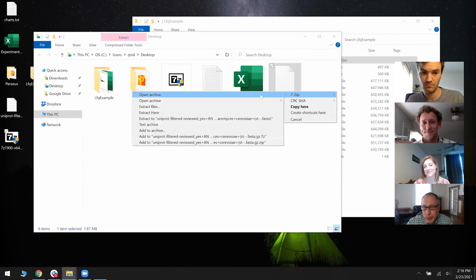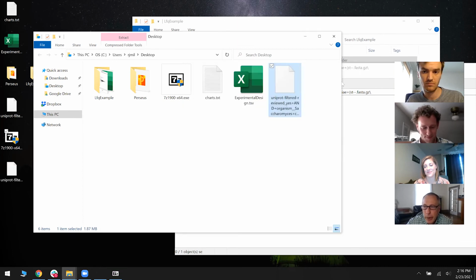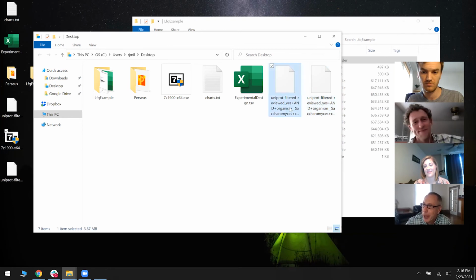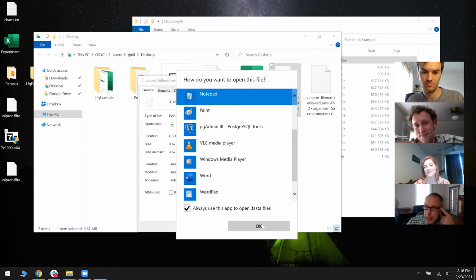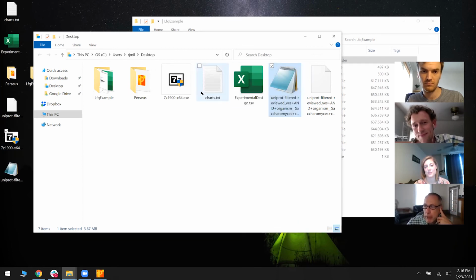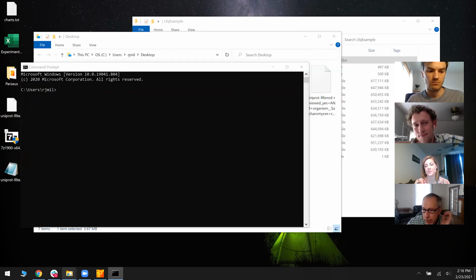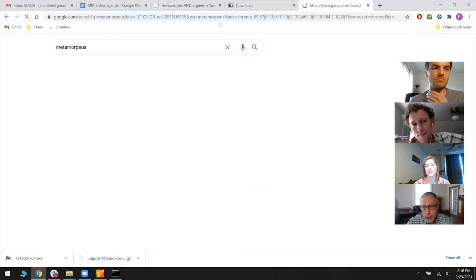And it was funny, when we started making Metamorpheus, my boss said, why do you want to make a search engine? Can't people do that already? Yes and no, right? Searches could be done with FASTA files at that time. You could identify proteins 10 years ago, but there's so much more to be learned. I feel like with proteomics the same thing is still true. Proteomics as a field has evolved a lot in the last decade. There's lots of cool stuff you can do that you couldn't do before, but there's just as much fun stuff to do now. Those are the things we continue to discuss and argue about, and we're not sure we have the right answer.